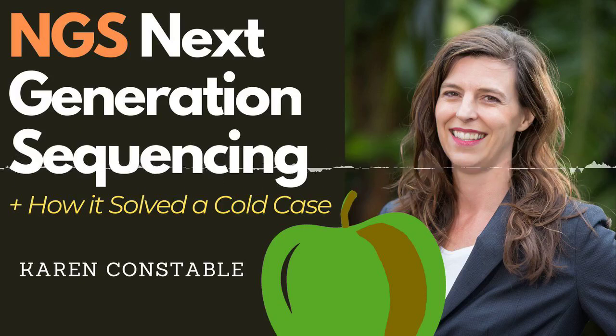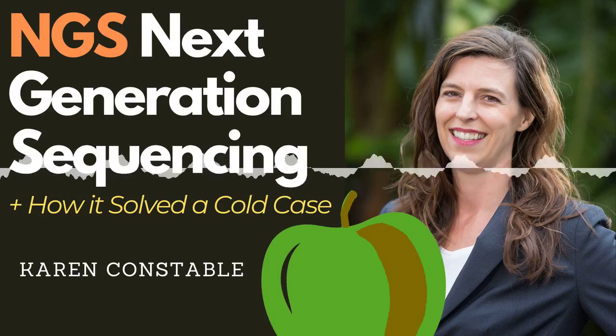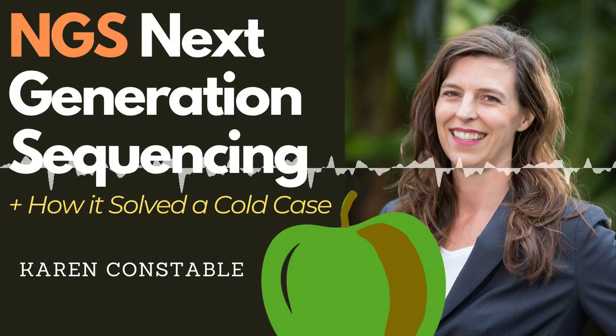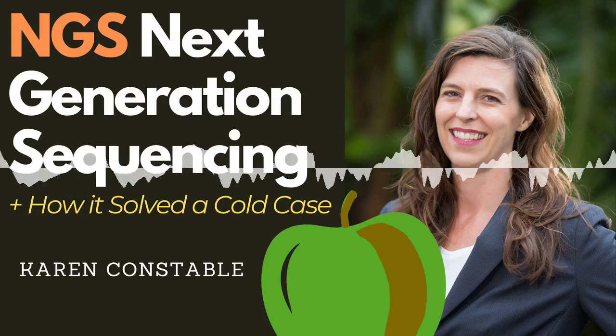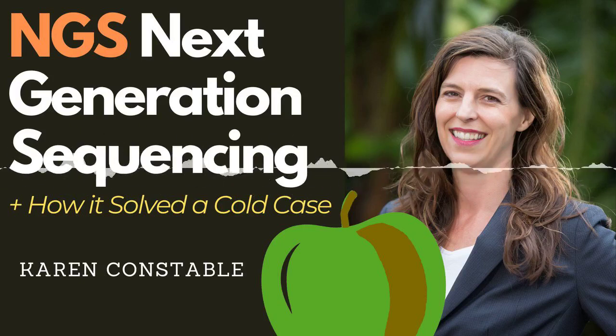The power of NGS. A mysterious series of sporadic listeriosis illnesses was solved using NGS this year. The illness had been appearing in Bavaria, Germany, for years. More than a dozen people had become seriously ill and 1 person had died. Epidemiologists had not been able to determine the source of the illnesses because it is difficult to know which foods they might all have eaten.